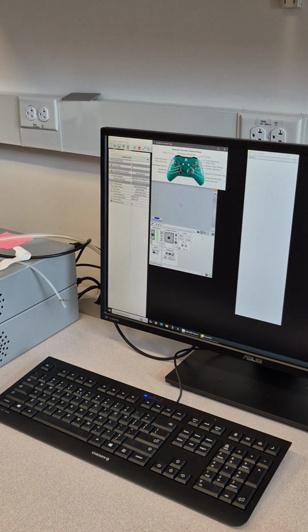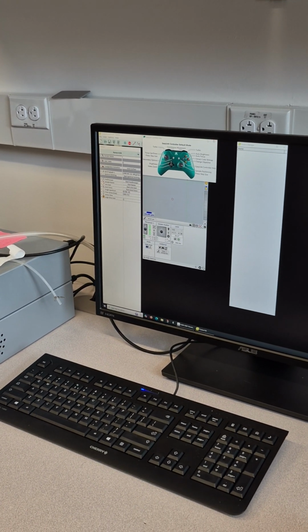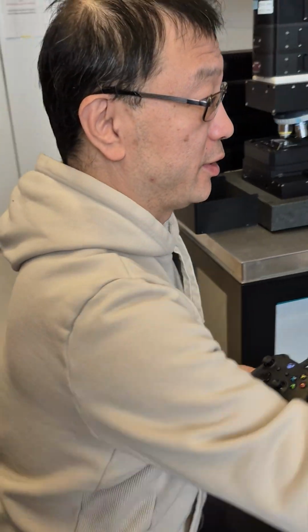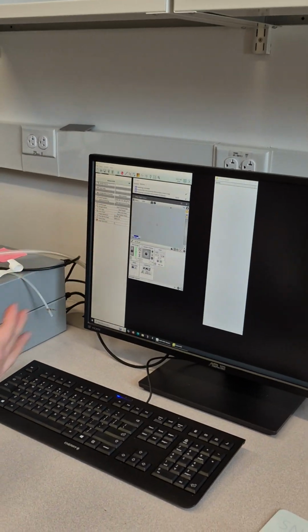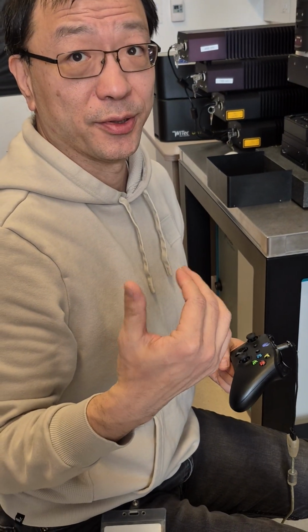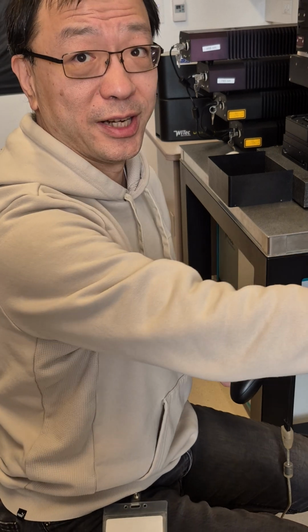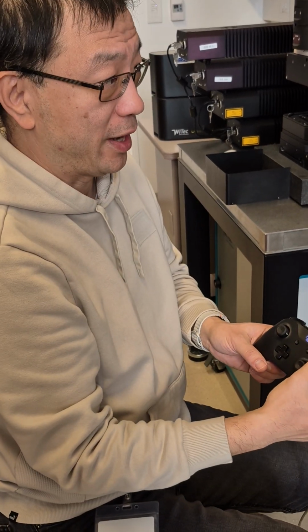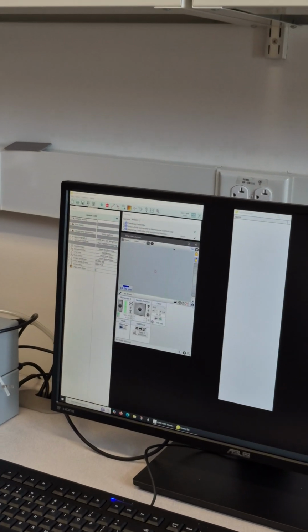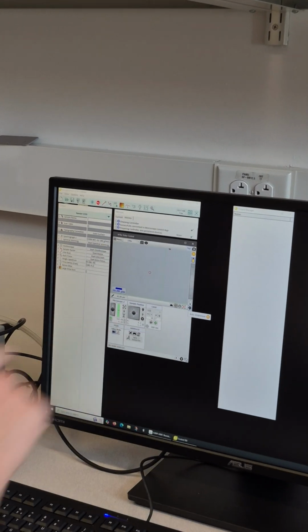Another very useful function is Y. After you go to a different place on your sample, or if you switch the objectives, the brightness of the image will not be adjusted automatically, so you must tell it to adjust. That's the Y, which equals this button, auto brightness.